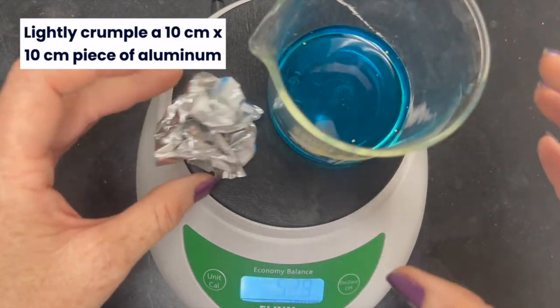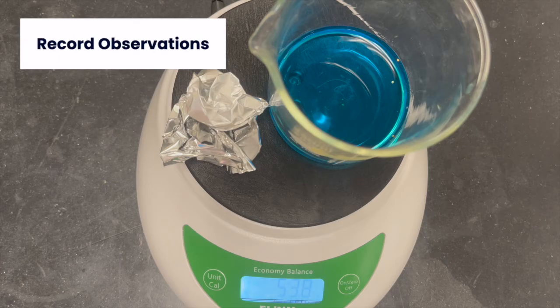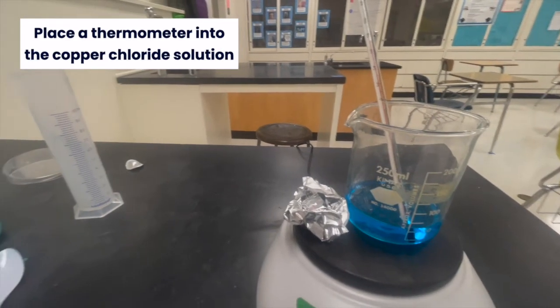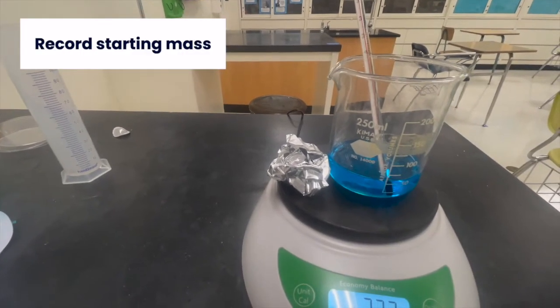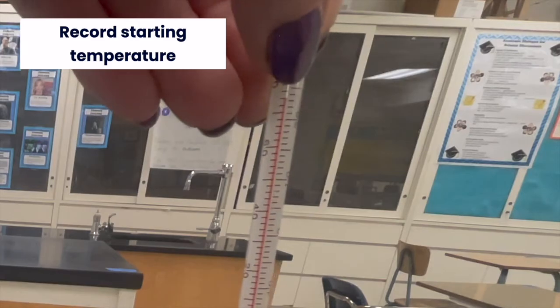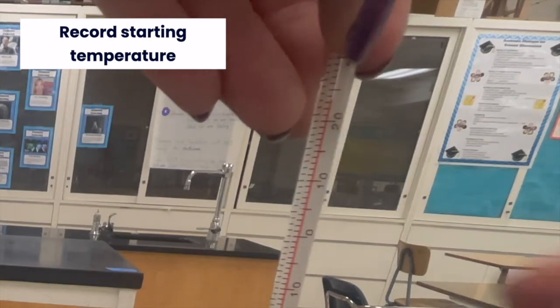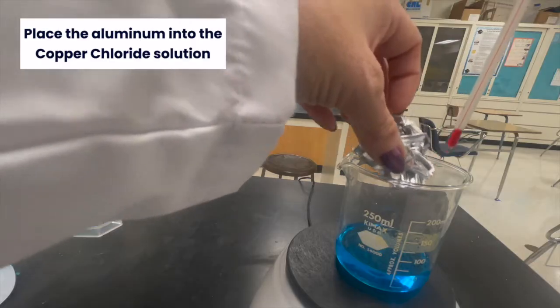Lightly crumple a 10 cm x 10 cm piece of aluminum. Place a thermometer into the copper chloride solution. Then place the aluminum into the copper chloride solution.